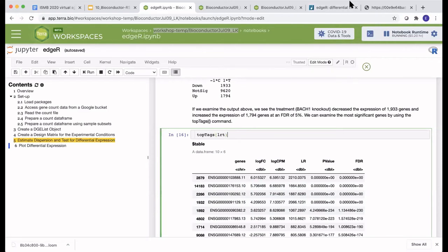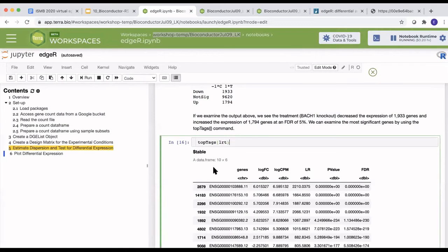Let me go back and, oh, sorry, go ahead. No, please go ahead. Okay. So again, I don't know how to export this list using R commands off the top of my head. So if anyone does, please speak up, because I can just do it for you guys right now. Write.table. What is that? Write.table, and then the name of the file.